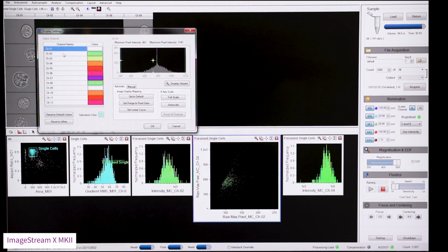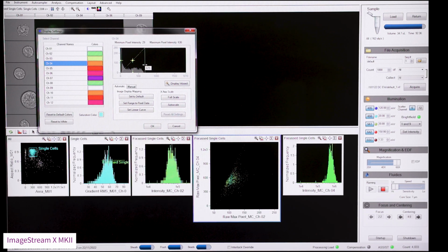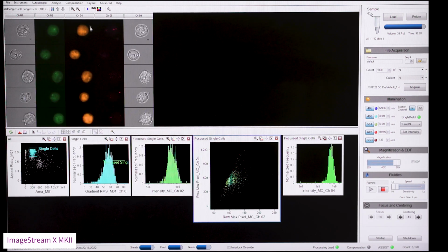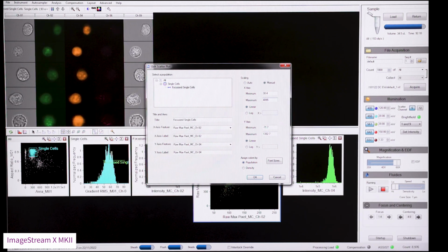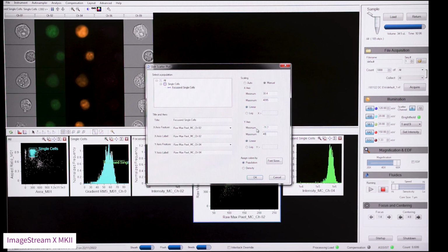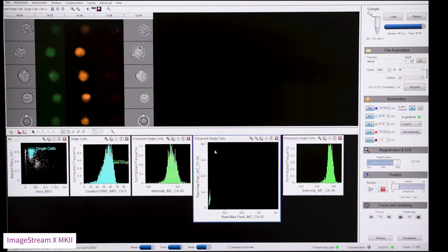Click on the display settings and click on channel 4. Adjust the right-hand line to the maximum of the graph and the left-hand line to the minimum of the data. Looking at the raw max pixel plot, we can check for saturation. If I set the scale from 1 to 4095, we can see there are no events at the 4095 value, which indicates we no longer have saturation.